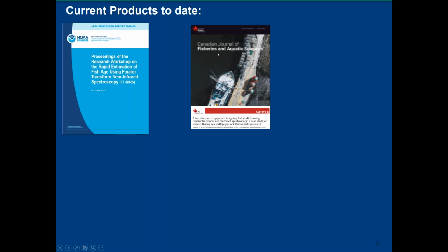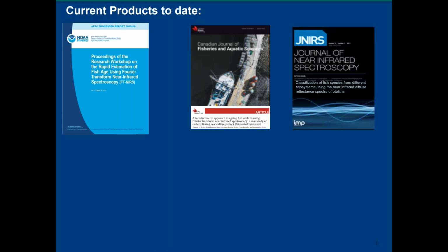This was our 2019 paper published in the Canadian Journal. We also published a paper in the Journal of Near Infrared Spectroscopy that dealt with using spectra from otoliths as a means of classifying fish species from different ecosystems.